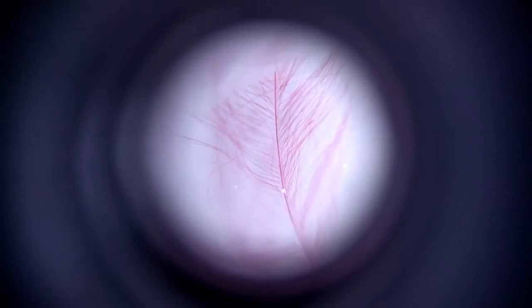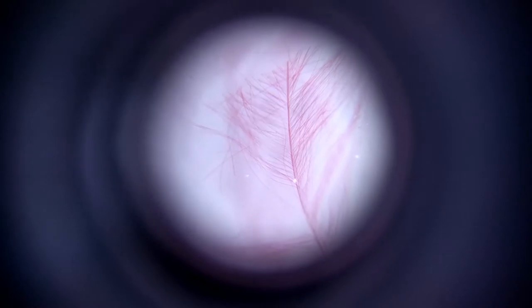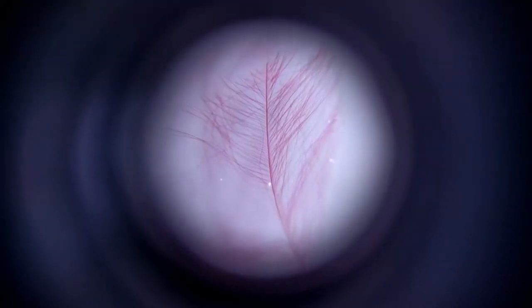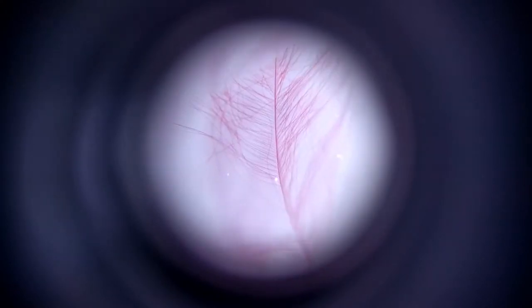We are looking at magnification of that duck feather. Let me just show you what this focus does. Currently I'm playing with the focus, and you see it lost the focus, and I'm trying to return the focus, and I think I got it. Let me just focus with the phone.